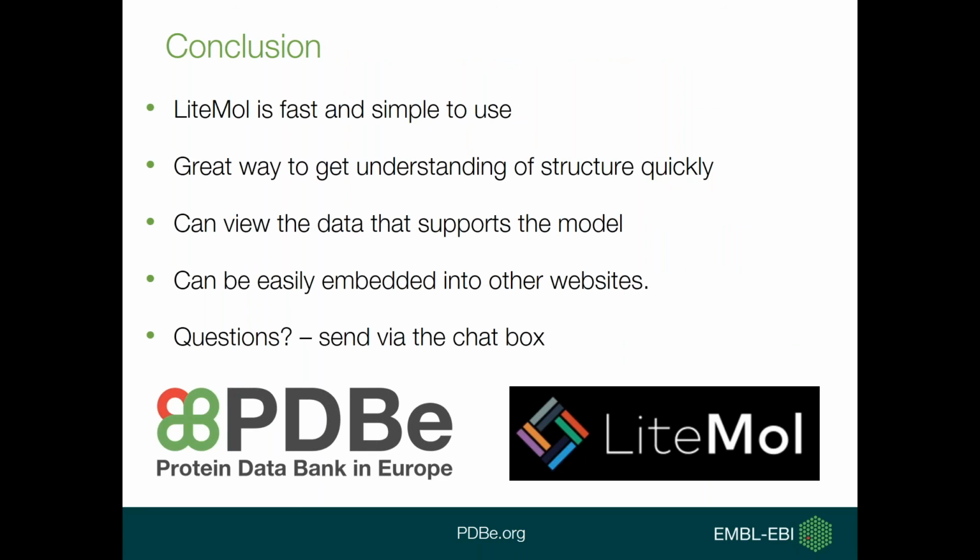So in conclusion to this webinar, LiteMol is fast, and it's hopefully a very simple to use visualization tool within your browser. We think that it's a great way to get a chance to understand the structure quickly without needing to go too in-depth, without having to download the files and view it that way. Another bonus is the option to view the data that supports the model, and this gives you more of a chance to validate what you're seeing. It can also be easily embedded into other websites if you want to use it for your own purposes.